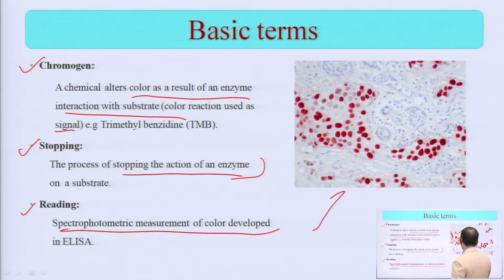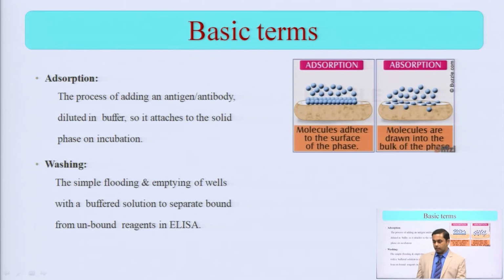For example, here you can see some reaction is happening with the enzyme and other substances, some substrate actually gets involved, and ultimately you get some product. So, chromogen will give the ultimate signal, it will give the color showing that yes, the reaction actually happened. Such things you can get.